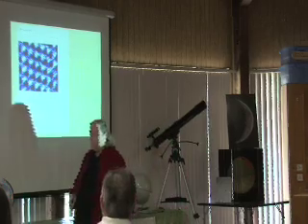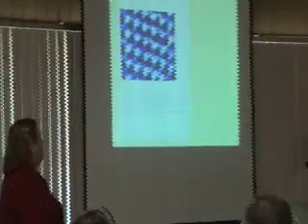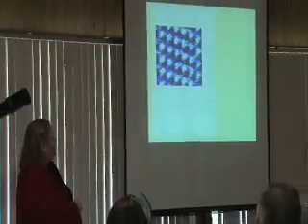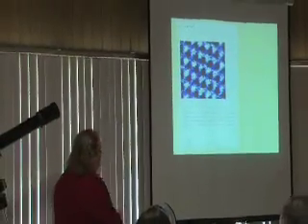This one is a very highly resolved view of calcium fluoride. So the bright areas are calcium, the dark areas would be fluoride. And again, it's a very regular periodic arrangement that you can see with an AFM.